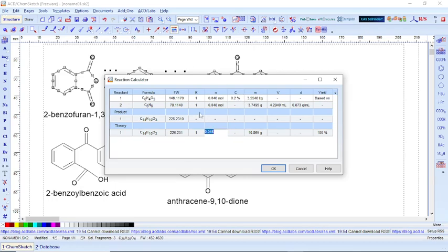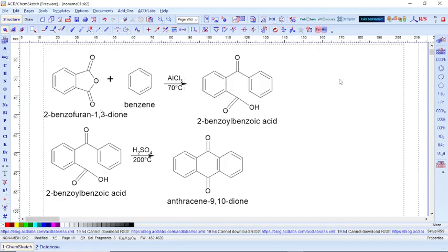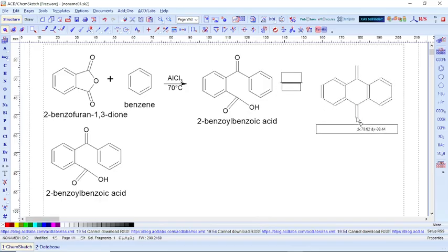Okay. Quickly, I want to show you some limitations. This reaction calculator cannot calculate a multi-reaction at once. Let me assume we have this. I want to do this for you. Let's say this is what we have now. All right.